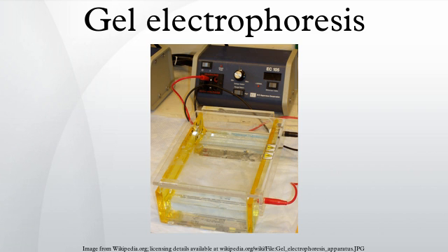DNA gel electrophoresis is usually performed for analytical purposes, often after amplification of DNA via PCR, but may be used as a preparative technique prior to use of other methods such as mass spectrometry, RFLP, PCR, cloning, DNA sequencing, or Southern blotting for further characterization.